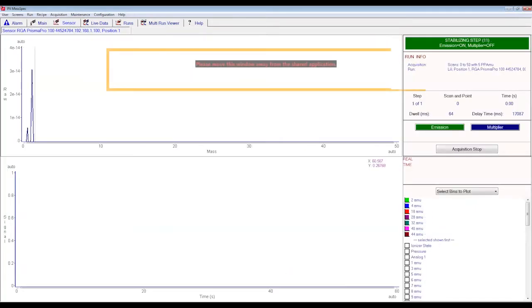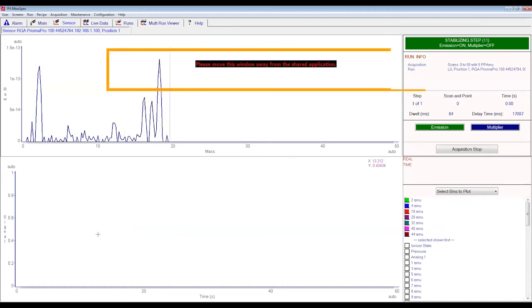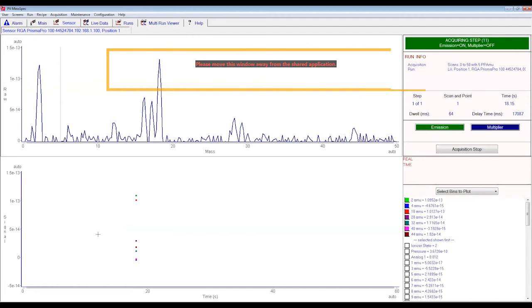So we have a mass spectrometer connected, as maybe I mentioned yesterday, to the first pumping stage. So we can try to analyze the gas which is actually pumped by the nozzle, which collects electrons together with some amount of gas. We can do an analysis of this gas.